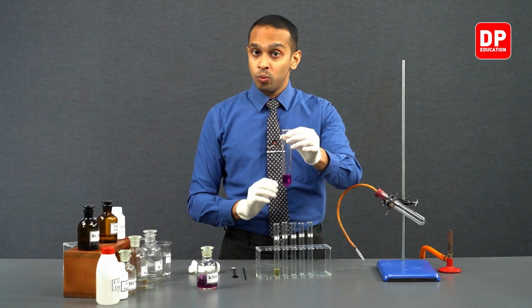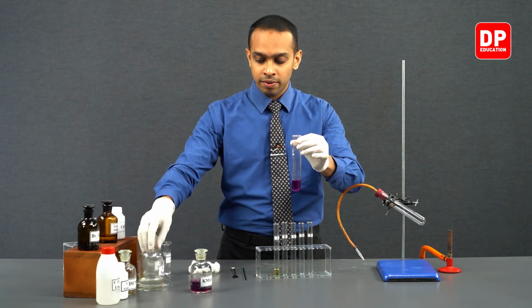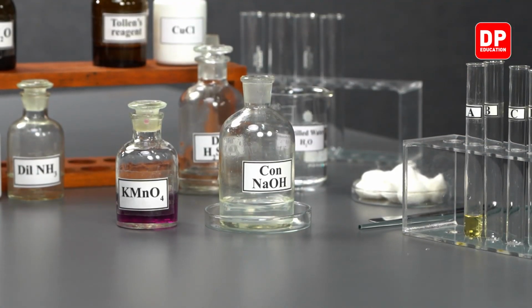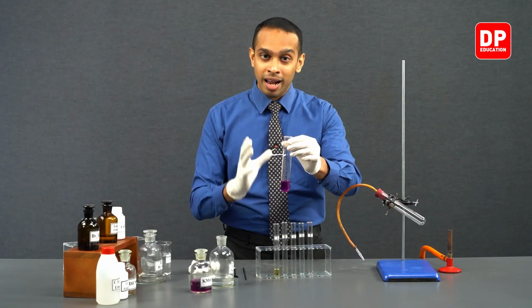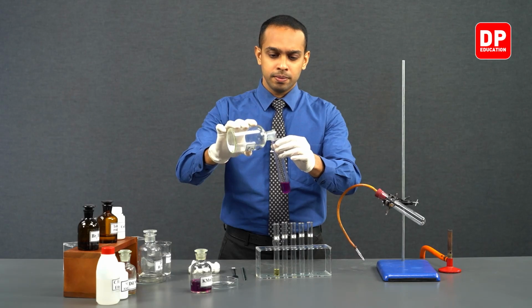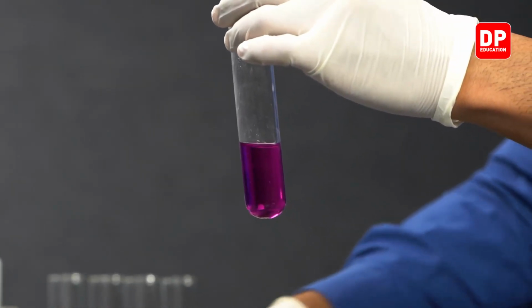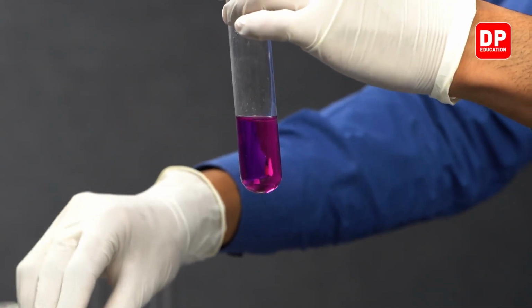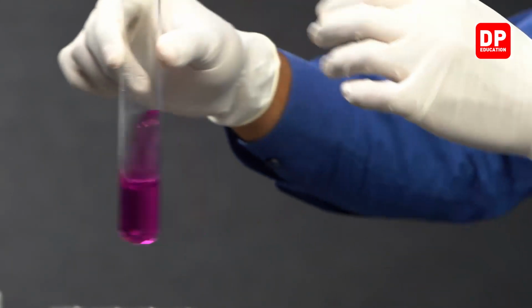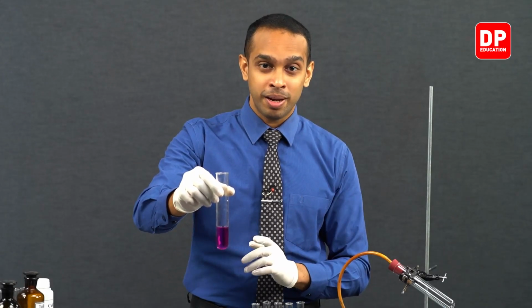And then we are going to add a base to it. We can add sodium hydroxide that we have here. By adding sodium hydroxide, we will convert this aqueous potassium permanganate into alkaline potassium permanganate. We have added a small volume of sodium hydroxide, and now what we have formed here is alkaline dilute potassium permanganate.